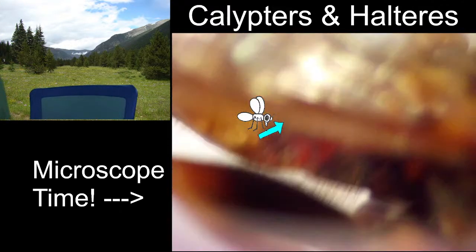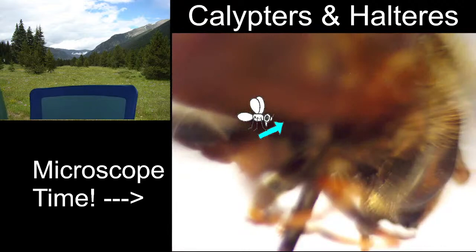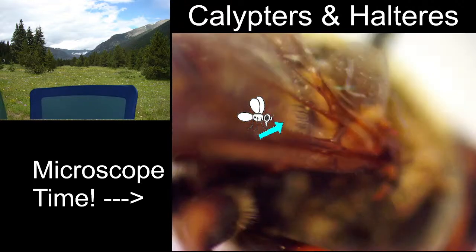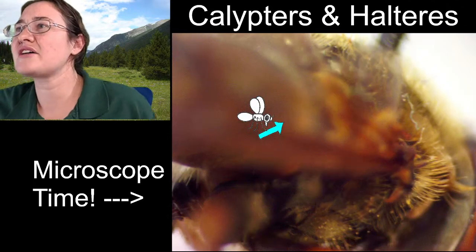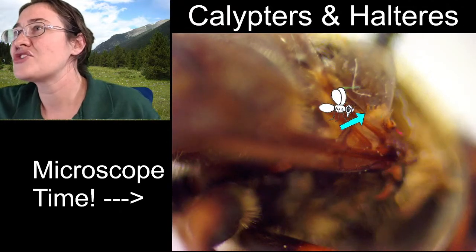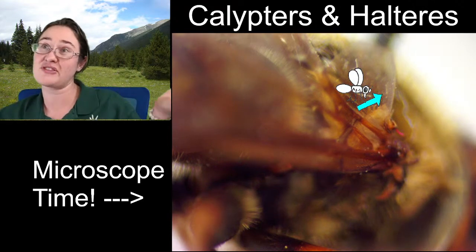Let's see. It's just really hard to see. The calyptor generally is going to be hiding underneath the wing, so you can almost see it. It's a really light disc. It exists right around here, and it's covering the halter.